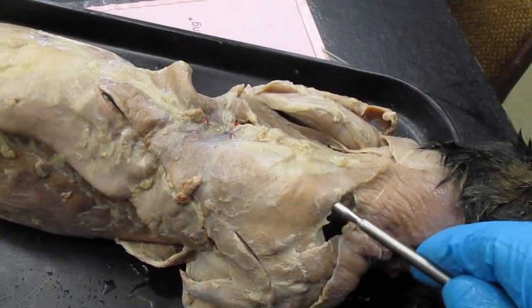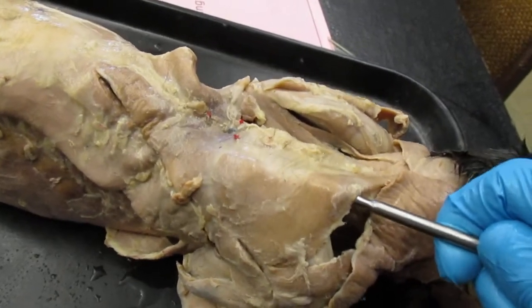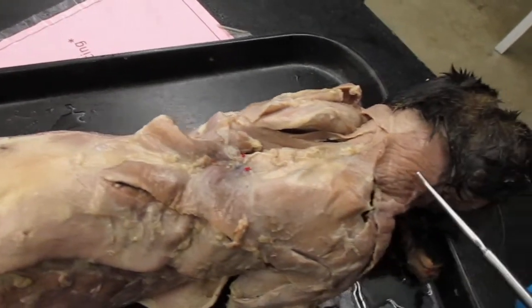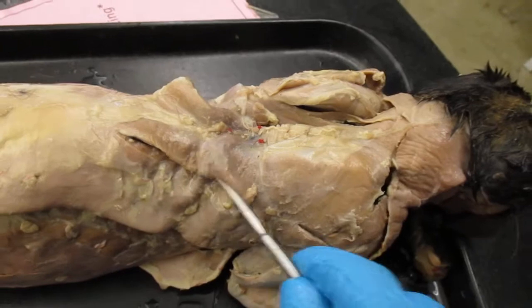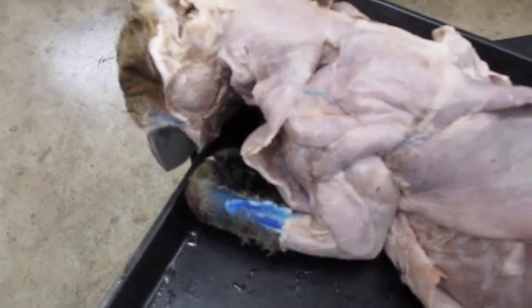Next, we have the acromial trapezius. And then spinal trapezius is right here. So, first we have the clavotrapezius. Next we have the acromial trapezius. And next we have the spinal trapezius. I want to show you on this cat. So, we can see these trapezius muscles again.